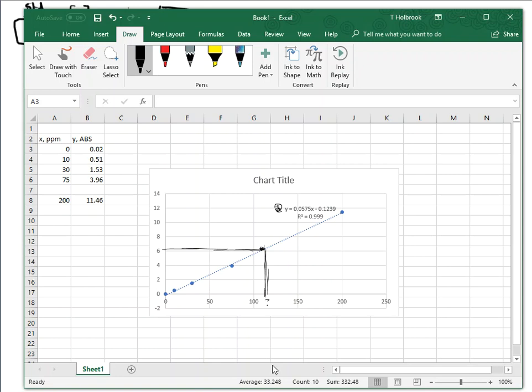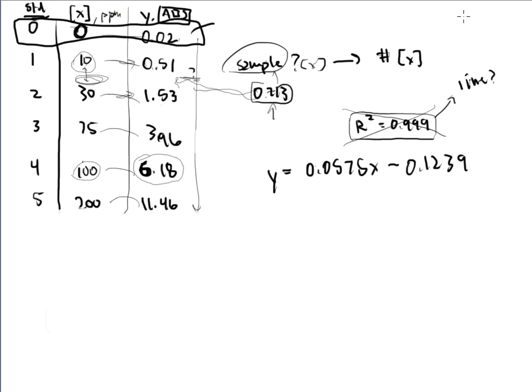Right? So I'm going to minimize this screen down. And I've got this equation. And remember, we ran a sample and we got an absorbance. All right, well, this is an absorbance. And absorbance, look, went in for the y-axis. So that means in this equation, the absorbance is represented by the y variable. Hopefully that makes sense. X is concentration, therefore x in this equation is concentration. Y was plotted for the absorbance, so in this equation, y represents the absorbance.